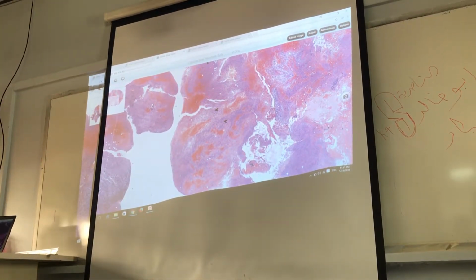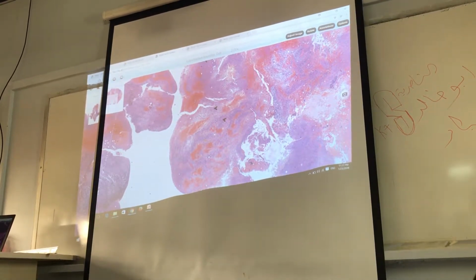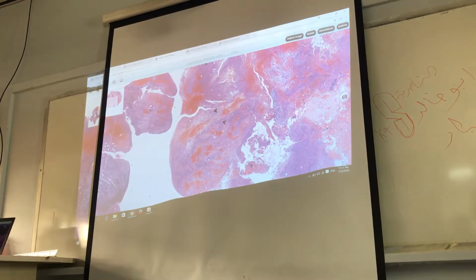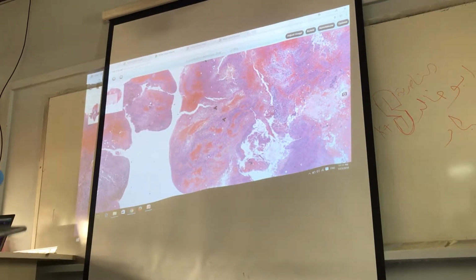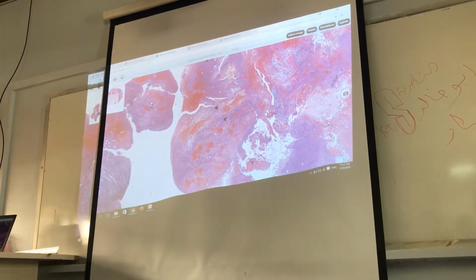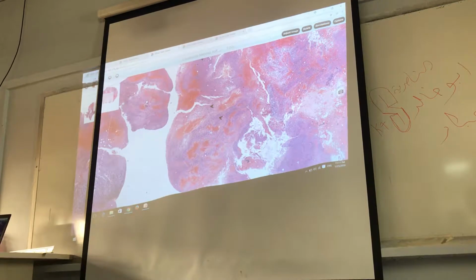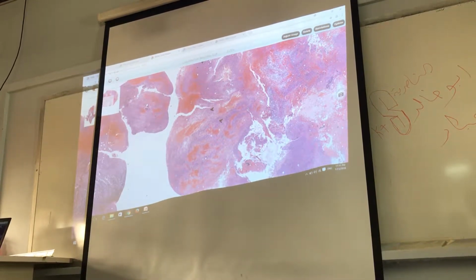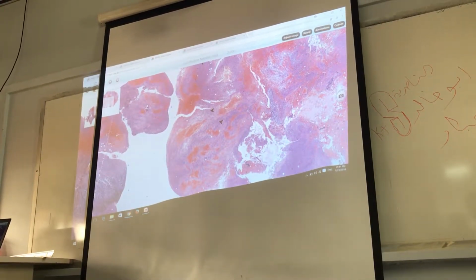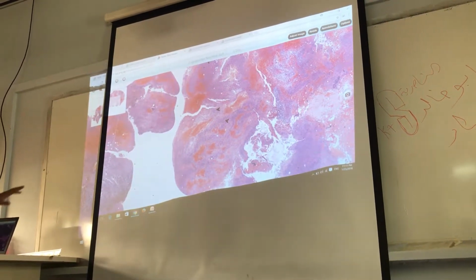Fluid. Suppose there is loss of blood supply to the CNS. What type of necrosis do we get? Liquefactive. Liquefactive means the structure becomes liquid-like. Are you seeing any structure? Any neuropil, astrocyte, oligodendrocyte, neurons, clear? Now this is the short form. We are seeing just hemorrhage.